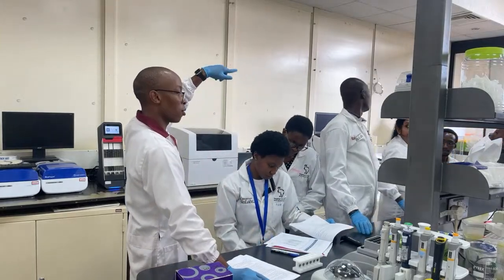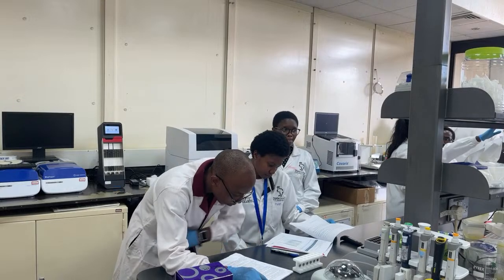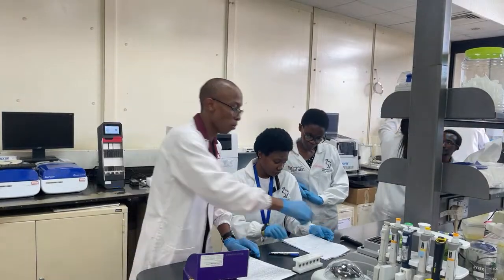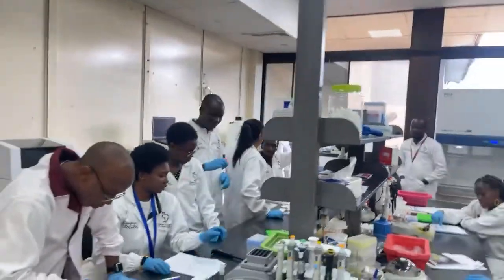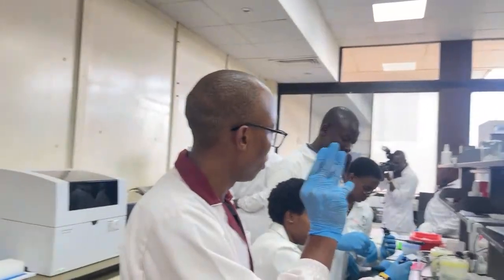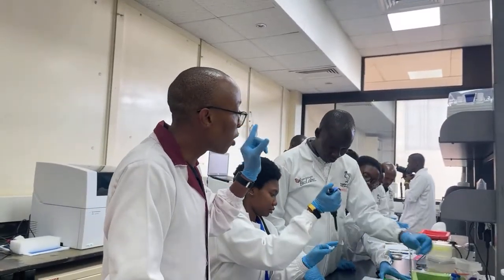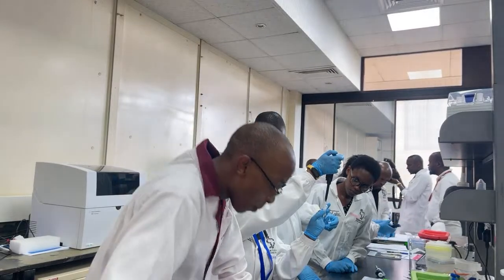Okay, one by one, please, so that you don't disturb the pellets. And then for those that already have the BL3, at this point, once you add the BL3, that's where you're going to see some cloudiness. So that is where your genomic DNA is. But first, guys, you remove the supernatant into a new tube, 300 microliters.